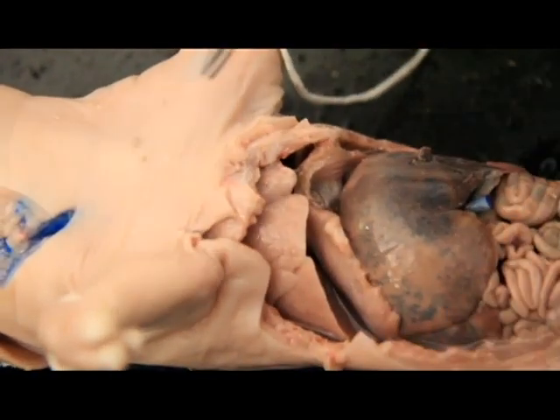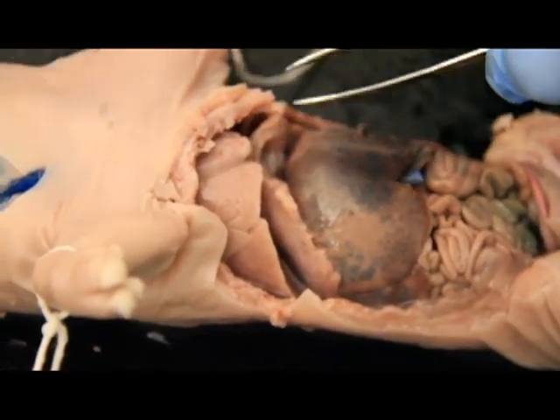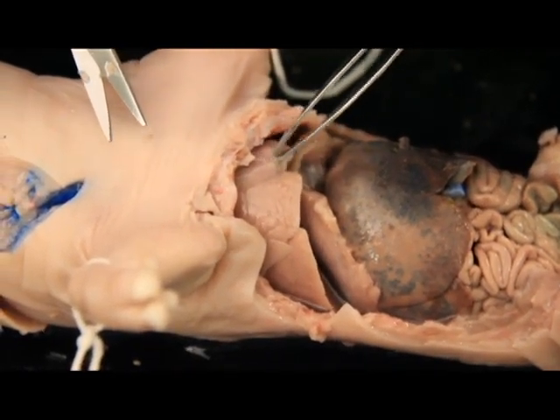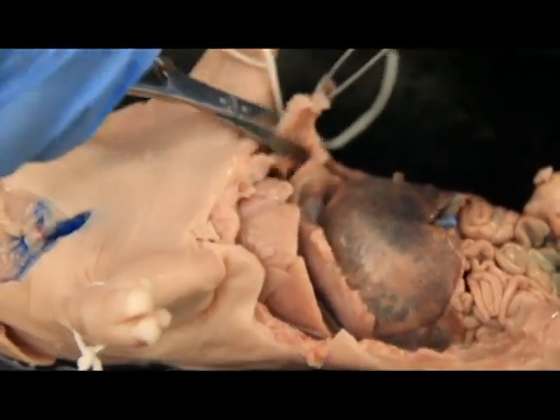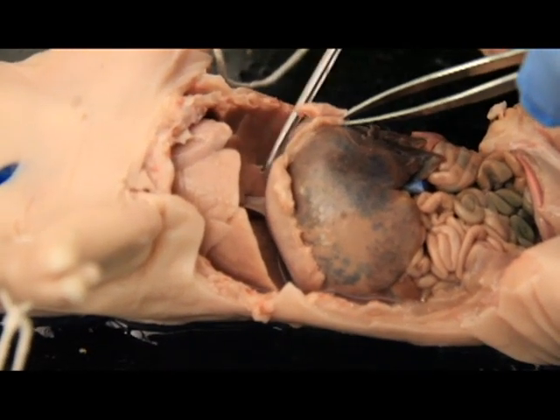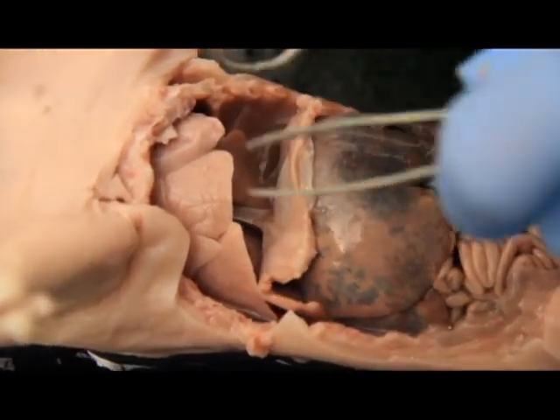So now we start to see the heart. So this is the lower part of the heart. And as we get in here, again, you want to slowly remove these ribs, but we don't want to go too deep. This is a thin membrane that surrounds the heart. If you go too deep, you'll actually cut that away, and we want to see that before we actually get below that. So I'm cutting this away, kind of cut these connections between the diaphragm. You can start to see more of our lungs right here. This is a giant blue vein, that's our vena cava back there, but we're going to get back to that.